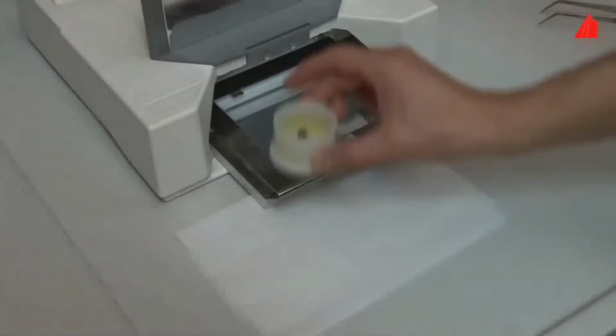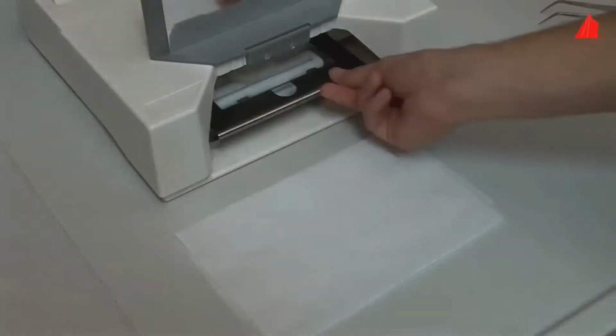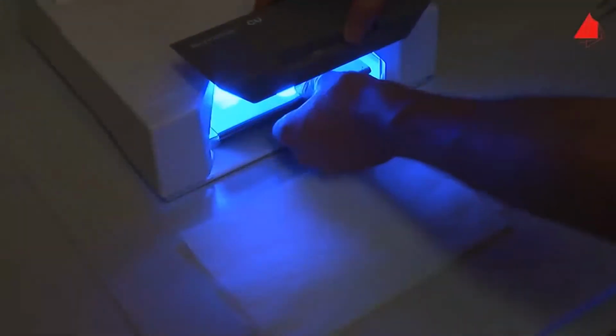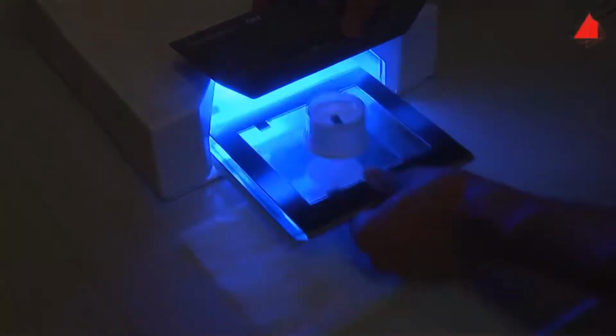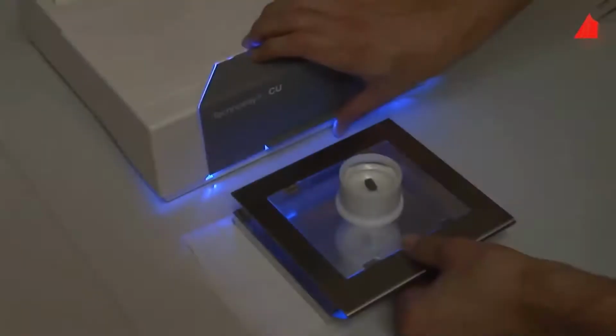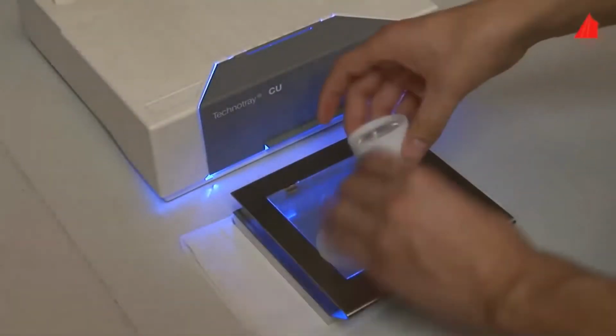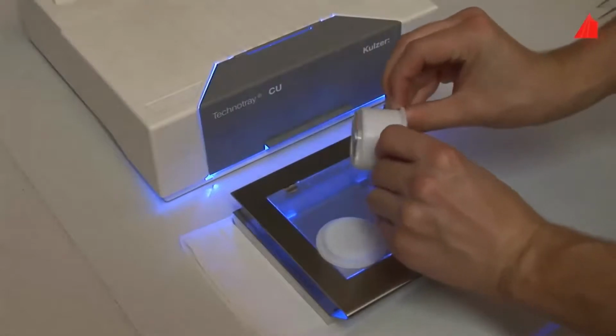Now the mold containing the specimen goes into the light curing unit. Under the action of intense blue light, the resin polymerizes within half an hour. The resin has cured and embedded the specimen well. As an alternative to light curing resins, many other embedding materials are available. Each of them has its own advantages and disadvantages.